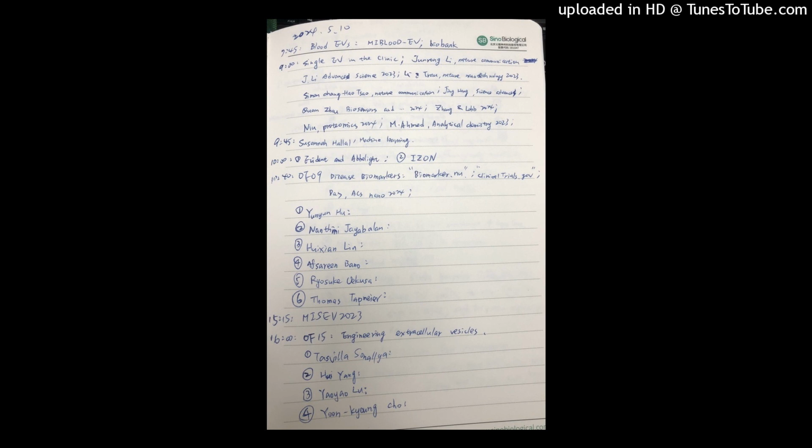In the discovery part, you have, of course, the proteomics part. You can do a top-down analysis or bottom-up analysis. For the nucleic acids, you can do next-generation sequencing, depending also on whether you want to do whole genome or exome sequencing, but you can also choose to do a microarray screening.